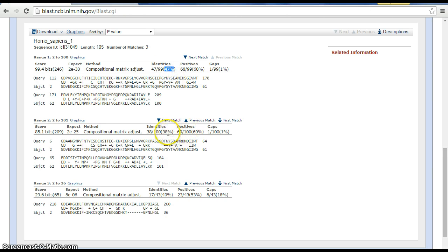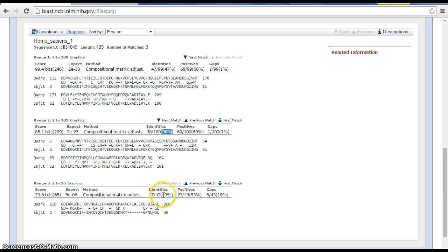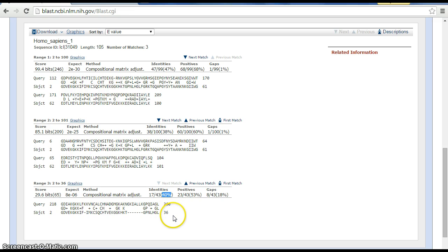For the second species, we compared to the Homo sapiens one, our match was 38%, and for the last species, our match was 40%. Those are the identity values you can enter in your table as the match to Homo sapiens.